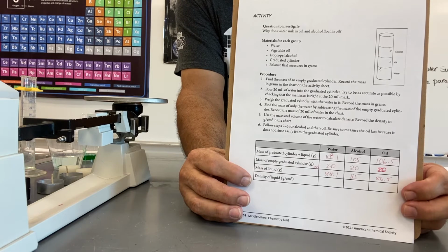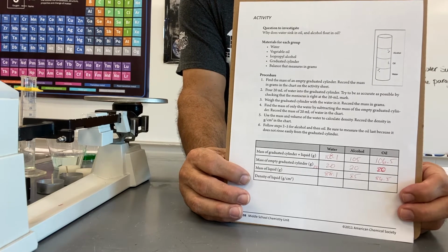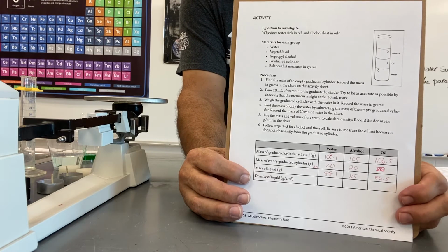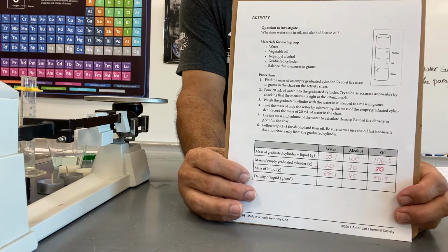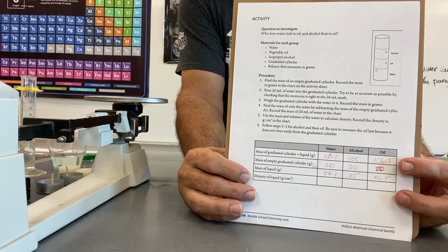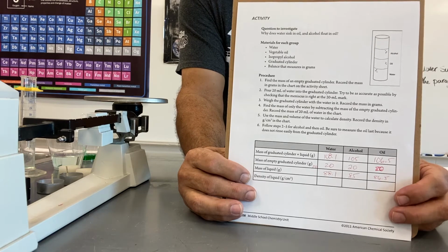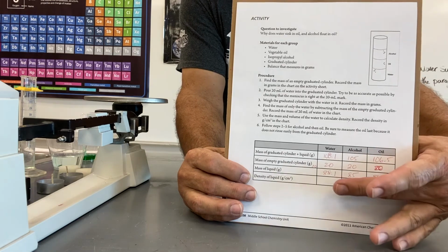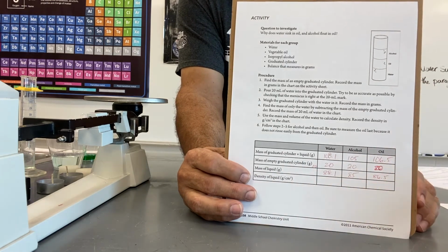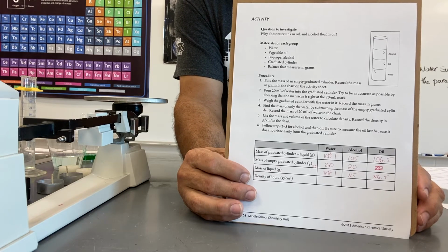If you remember from earlier, density is mass divided by volume. Density is mass over volume is the way we've written it, or M over V. So you can now calculate these things by dividing mass by the volume. And remember, our volume was 20 milliliters. Go ahead and calculate those for each of these things in that column, and then you'll be done with this step, and we can move on to the next step.